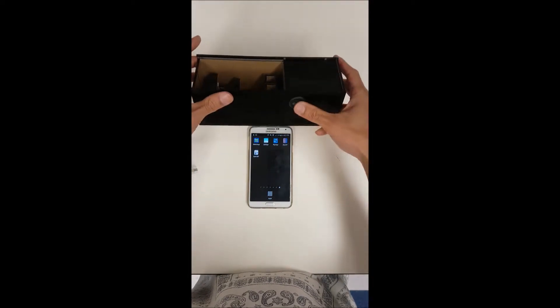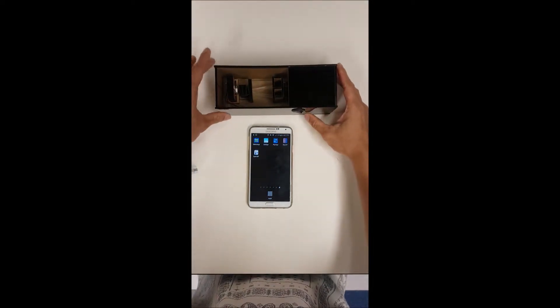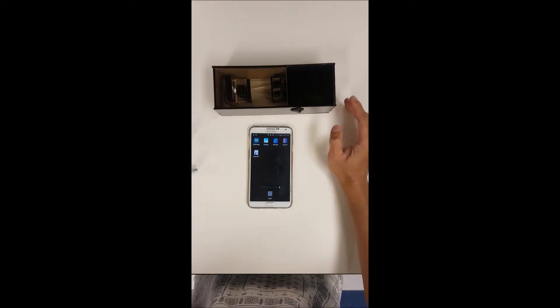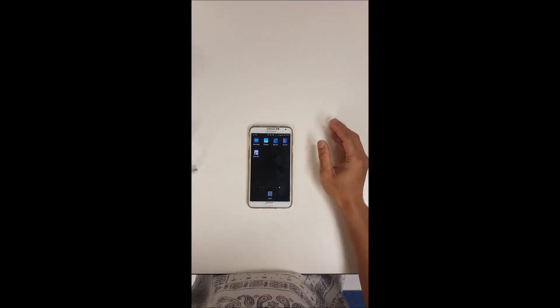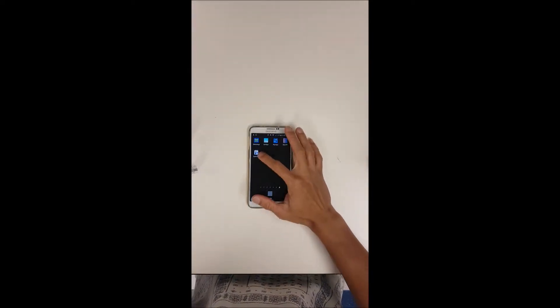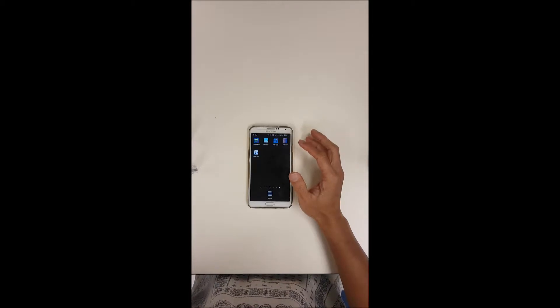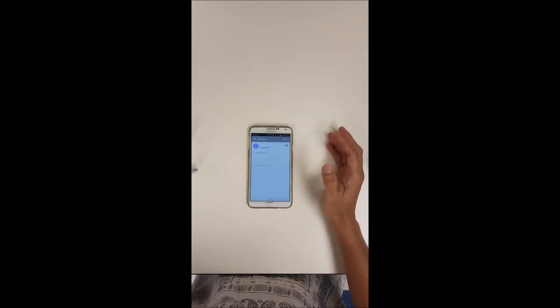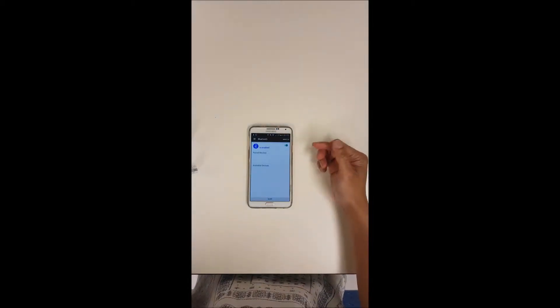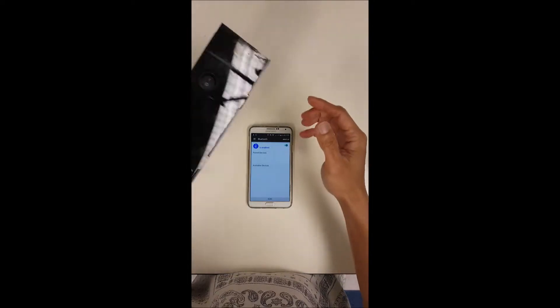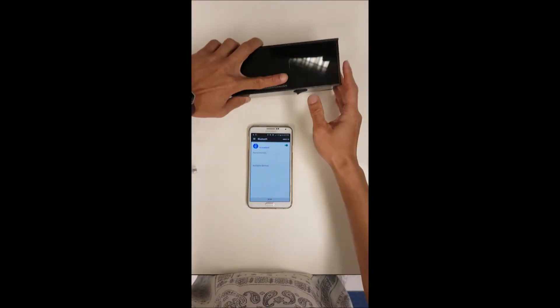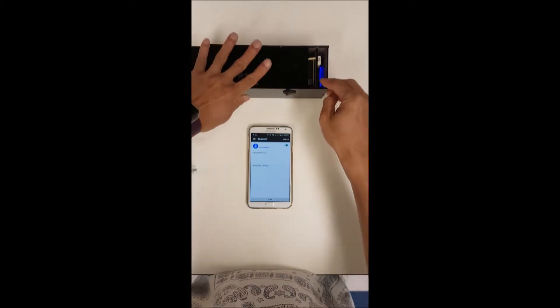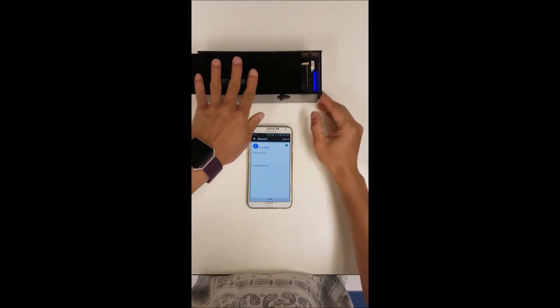There's an on-off switch here which you must remember to turn on before you do the Bluetooth. Talking about the app, you can see there's a SPECTBT icon here. This will allow connection using Bluetooth. Before we do this, please do not forget that you must turn on the Bluetooth and you can see it by a little glow of blue light here at the top.